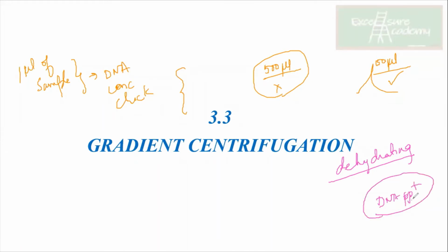But I cannot work with the precipitate. So I will put it into the water or the TE buffer so that I can get access and I can work. Precipitate पे enzymes काम नहीं करेगा. It should be soluble. So it is okay. I mean, it's correct that it should get dissolved. Dissolve मतलब गायब नहीं होता ना. It just gets reconstituted in water because in the nucleoplasm also your DNA is suspended. जो भी nucleoplasm रहता है, it is not like ऐसे cavity type where nothing is there. Correct? You do have the nucleoplasm and cytoplasm.